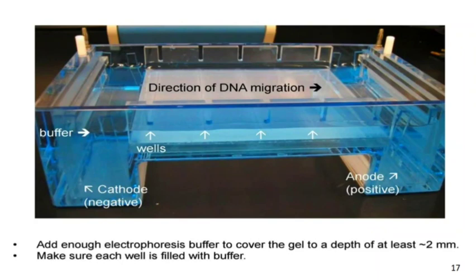Add enough electrophoresis buffer to cover the gel to a depth of at least 2 millimeters. Make sure each well is filled with buffer.